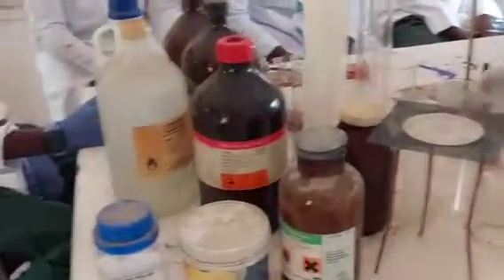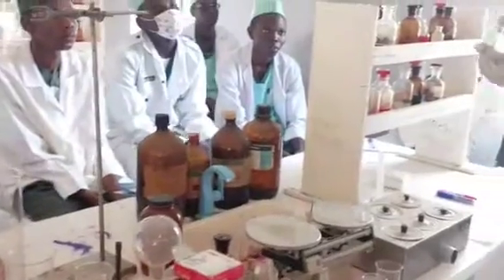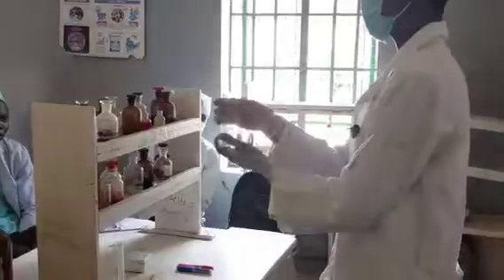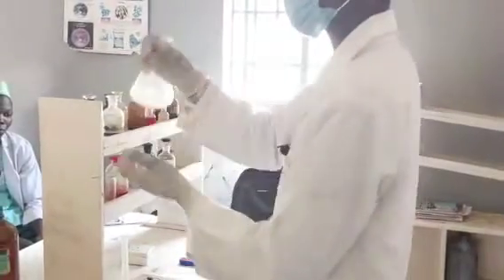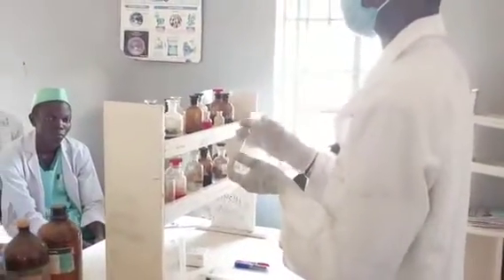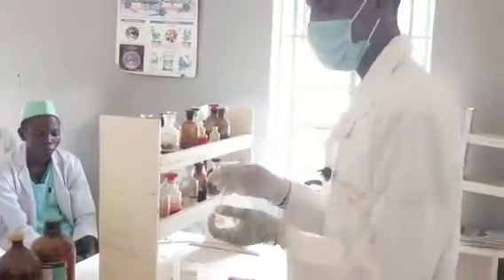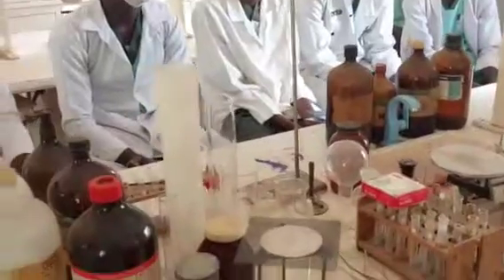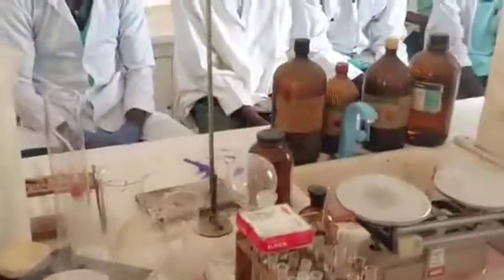Like for instance, this one is our glassware, a conical flask, right? For a layman, he can say, okay, let me use this for drinking. It's not possible. Why? Because chemicals are being used inside the conical flask or containers. So you cannot use it for either eating or drinking purposes.